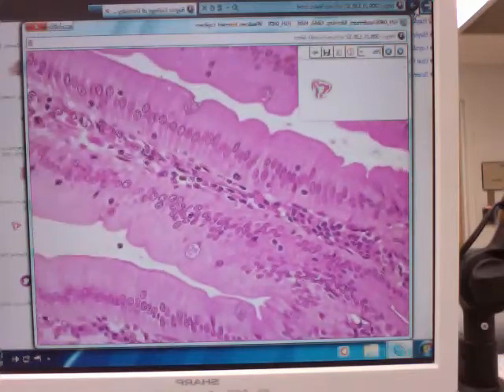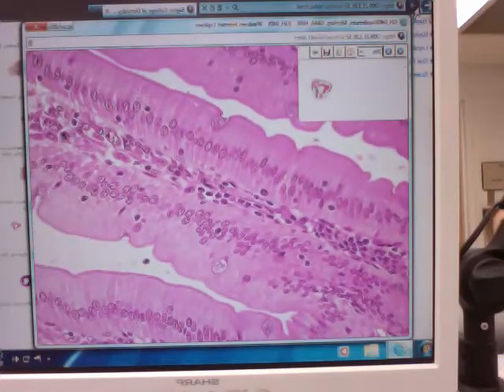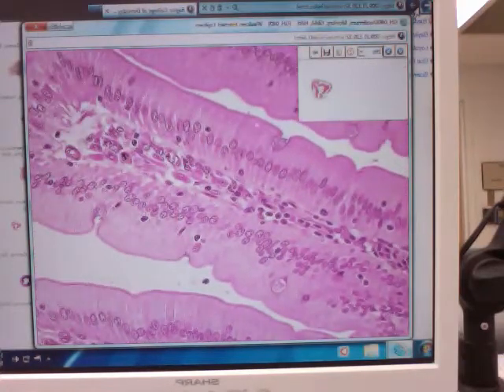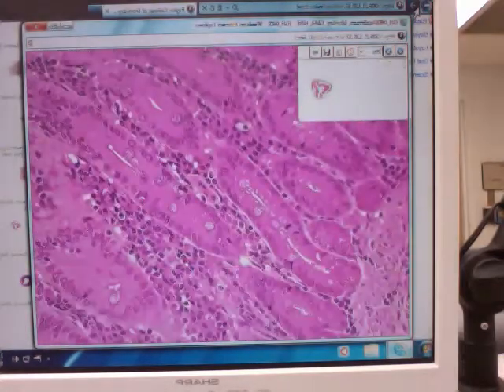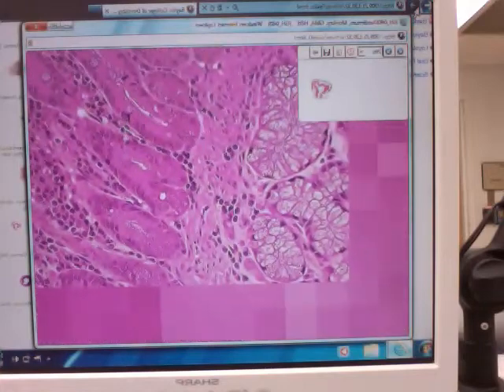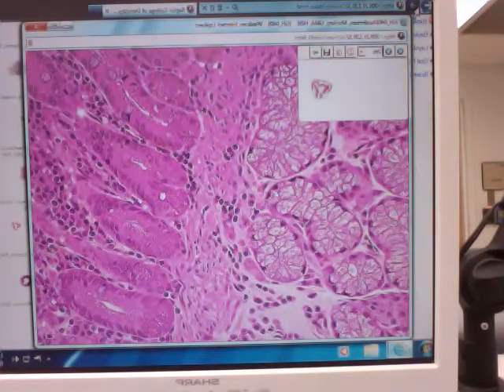And here you see lots and lots of cells. You don't see hardly as much pink collagen fiber scattered throughout this. So if we keep working our way down, we'll get down here to the base, and all this stuff in this area is loose connective tissue, still loose connective tissue. Lots and lots of cells, pink collagen fibers. It's all about the ratio of cells to fibers.